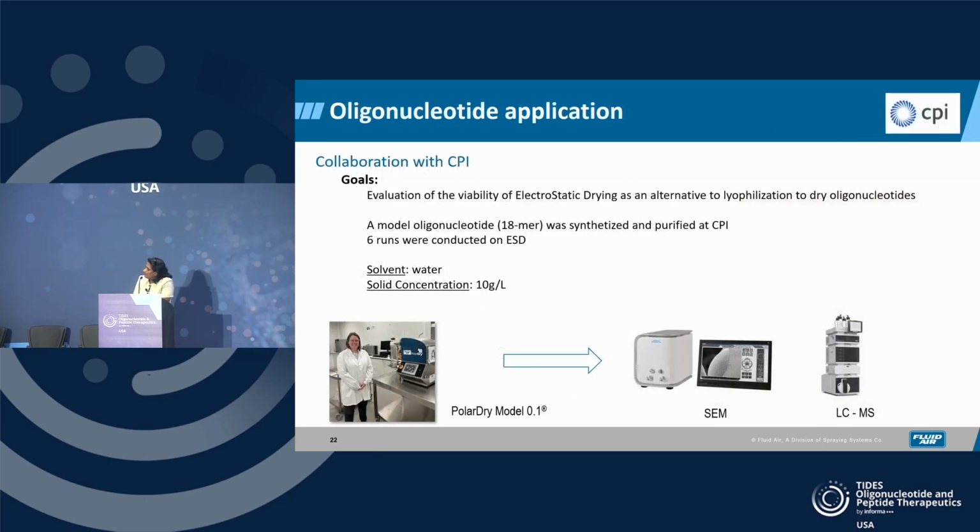So going to the TIDES portion, I have two case studies on oligonucleotides and peptides. The first is oligonucleotides. We conducted a collaboration with CPI in the UK on electrostatic drying with oligonucleotides, an 18-mer.